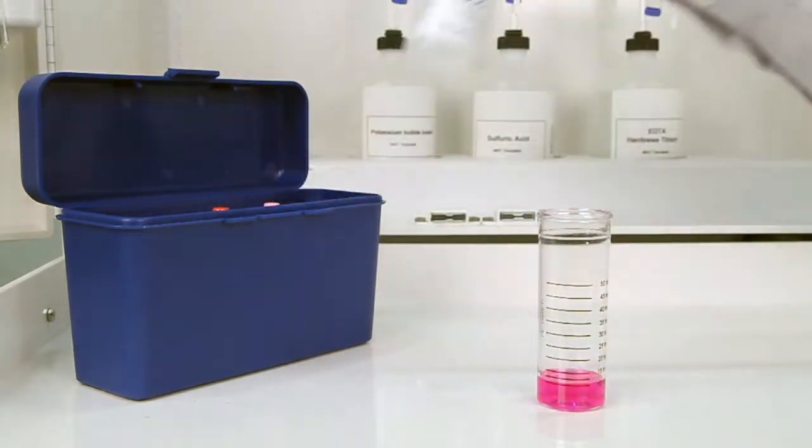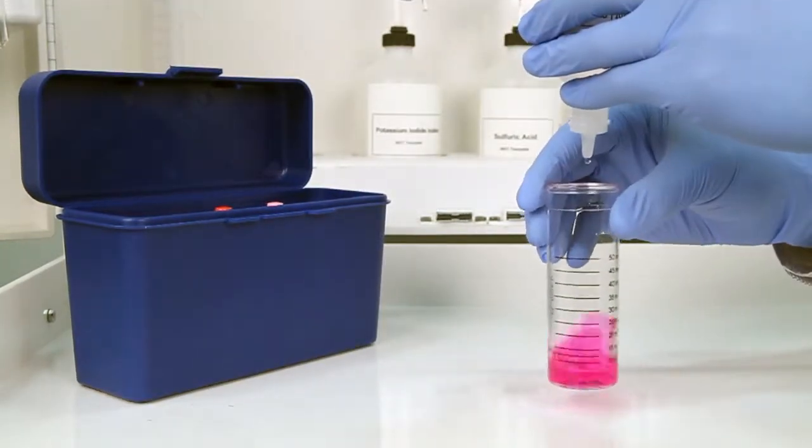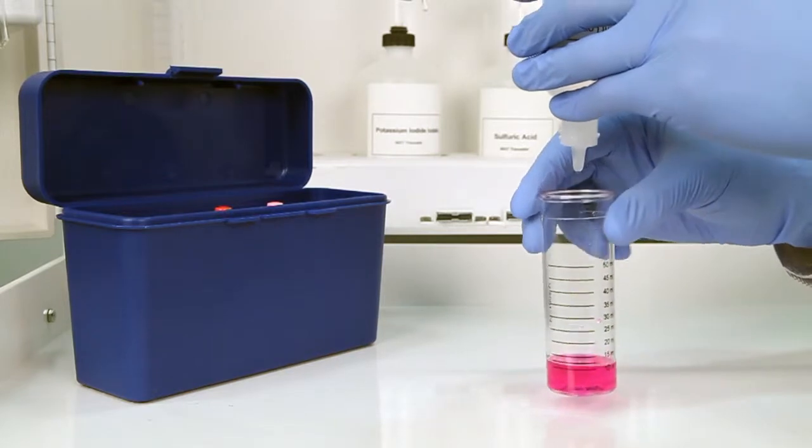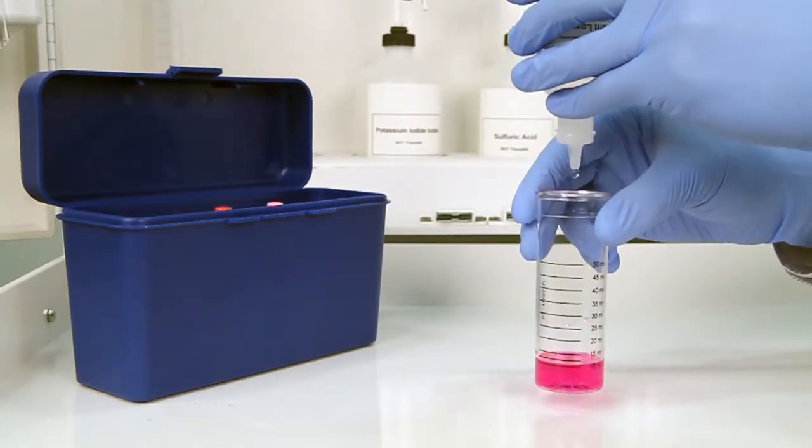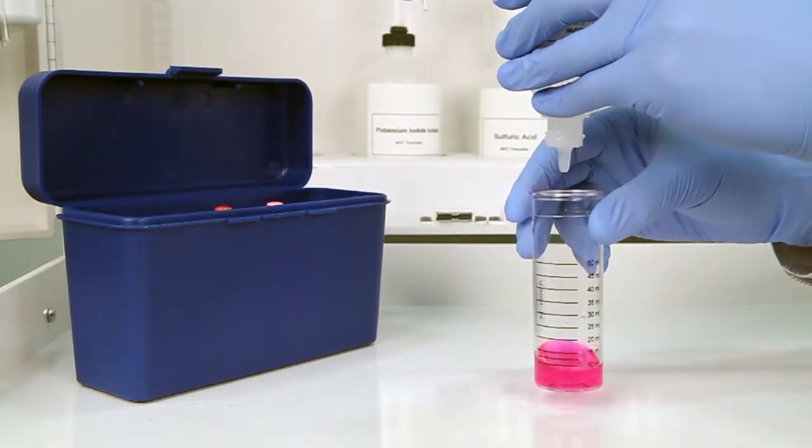The next step is to perform the titration using sulfuric acid 0.5 normal. Each bottle of titrant is labeled with the equivalency and sample size it was manufactured for. It's important to make sure you have the proper titrant and the proper sample size for this titration.